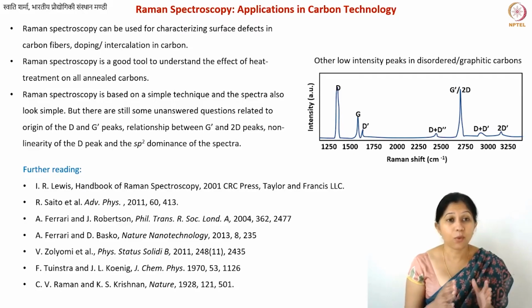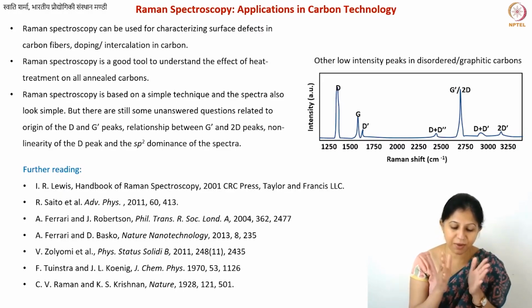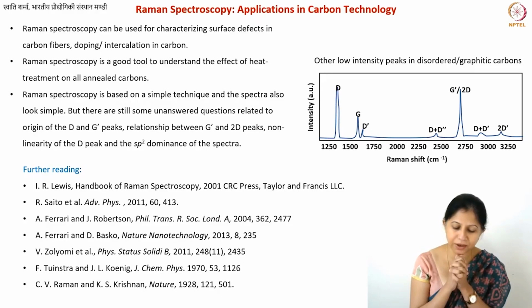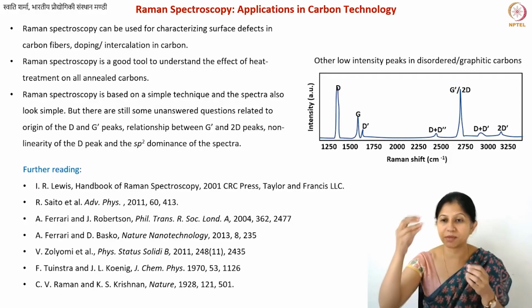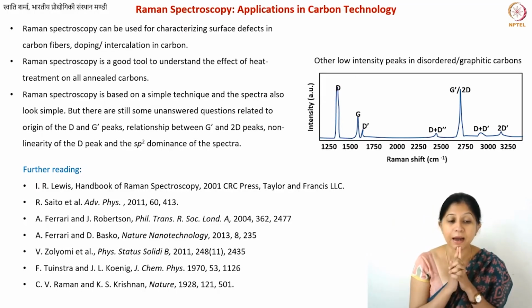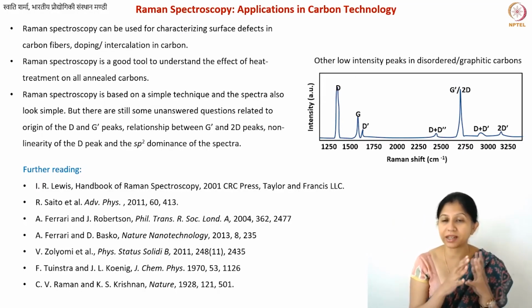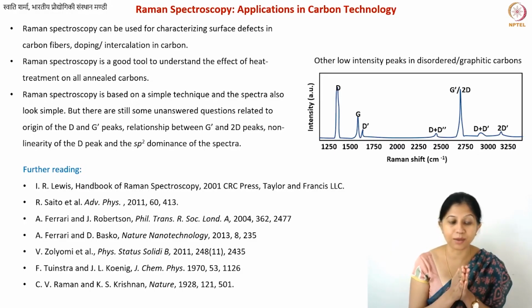Yes. So one interesting thing is that I have told you before that this Raman spectroscopy is very simple, and we can perform the experiments very easily. Also, you don't need to worry about the substrate very much. You can take a material inside a polythene bag, and then you can just take the Raman spectrum at various places. Also, the setup is not, compared to many other techniques, terribly expensive. You just need a laser source. In fact, if you think about the original work that was done by Raman, he just used sunlight as his source of photons. So this is a simple technique in principle.